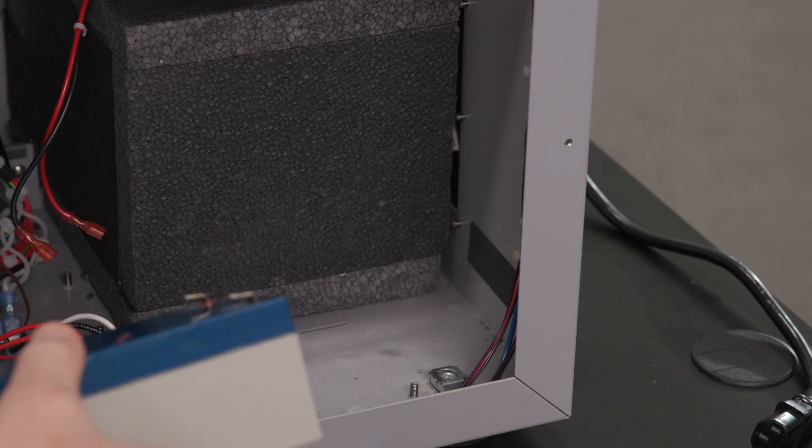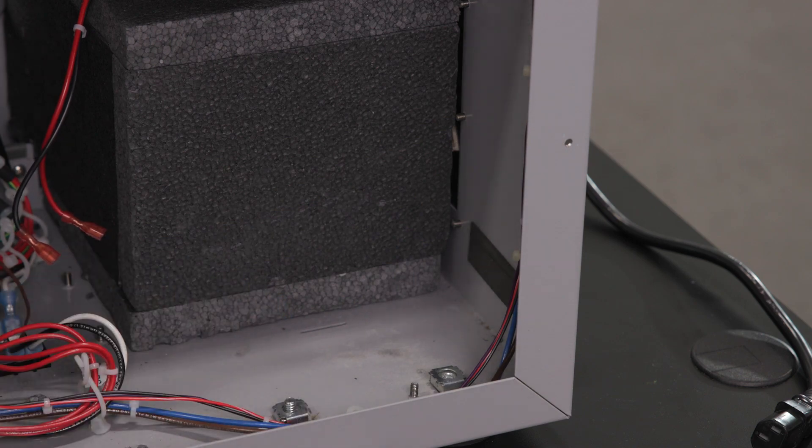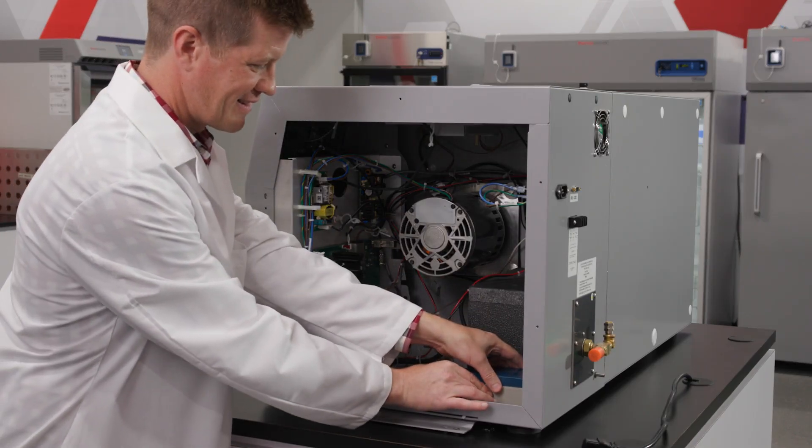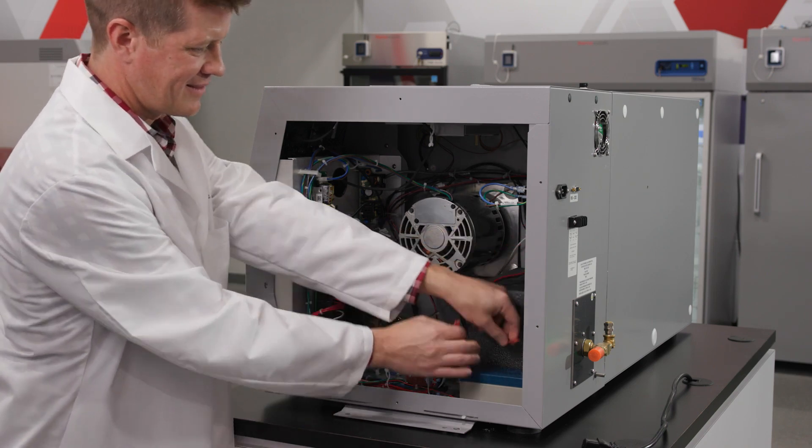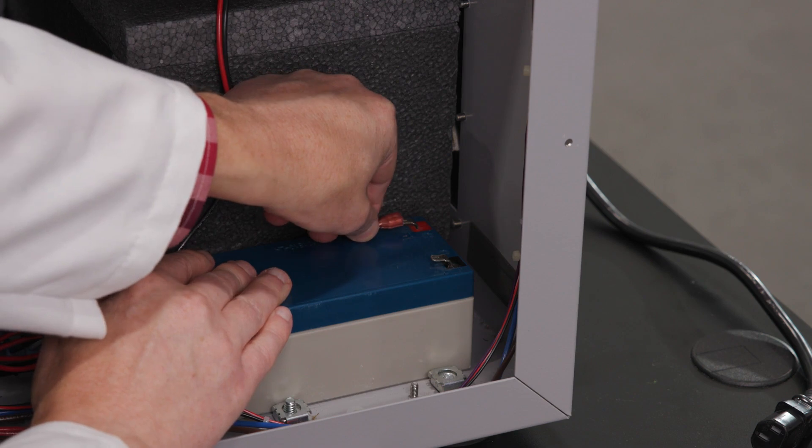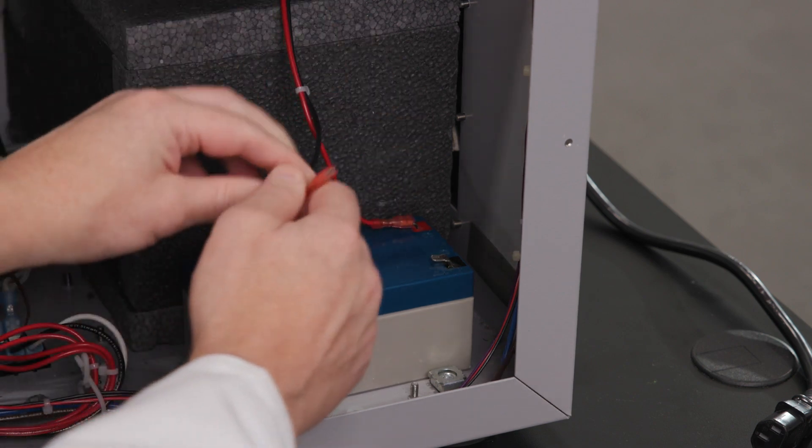Once the old battery has been removed, the new battery can be placed into the unit. When connecting the wires back to the terminals, follow the reverse procedure by attaching first the wire to the positive red terminal and then attaching the wire to the negative or black terminal.